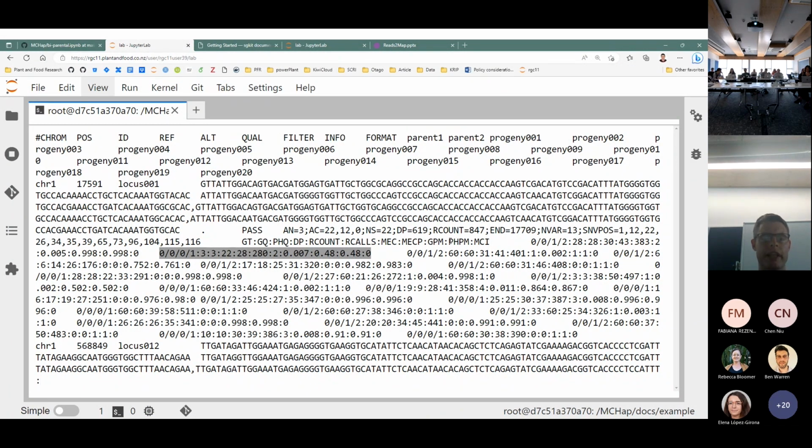The second value here, PHPM, is very similar and it'll often be the same value, but it might be slightly higher. That's a probability that at least the unique alleles in that call we think are correct. So the first probability takes into account the dosage, where the second probability doesn't take into account the dosage.